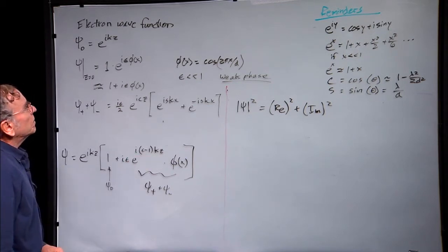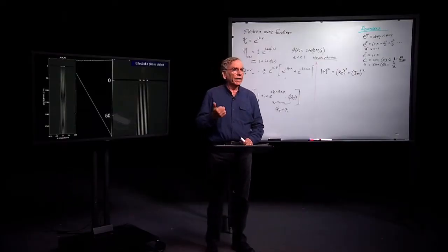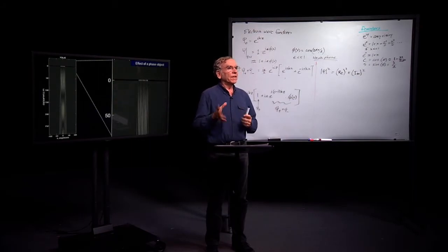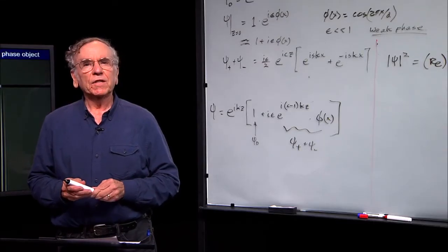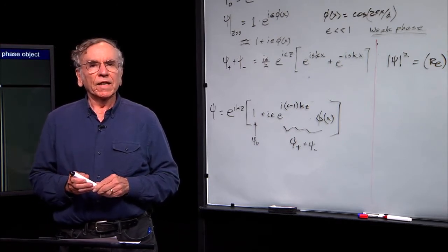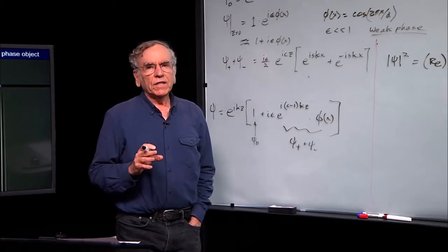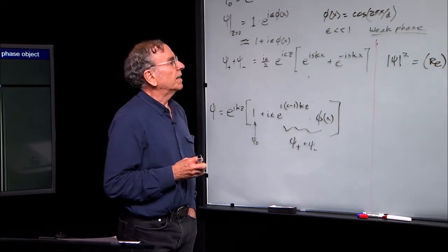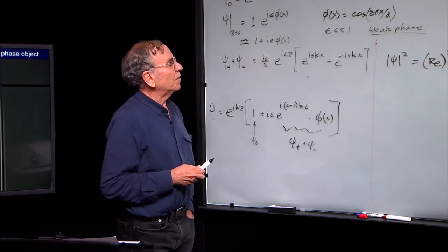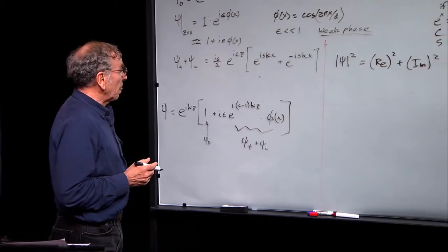Why is the angle small? Well, remember that the sine of the angle theta is just lambda over d. Lambda is a very small fraction of an angstrom, so if d is a few angstroms, this number is really quite small. So in our case, with d being 5 angstroms, sine theta is 1 over 250, so it's only 4 milliradians, or a very small fraction of 1 degree.